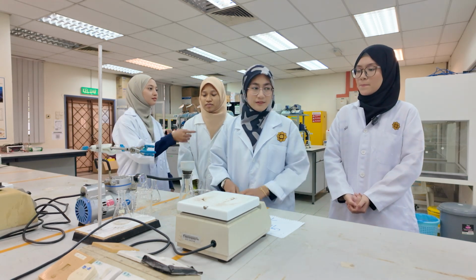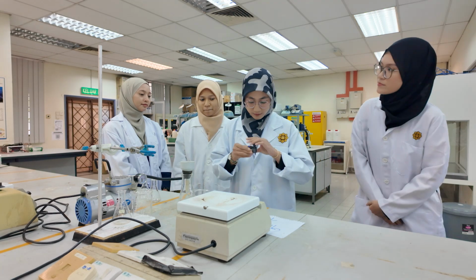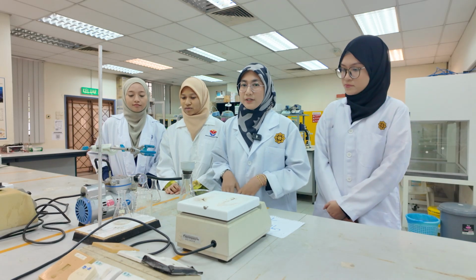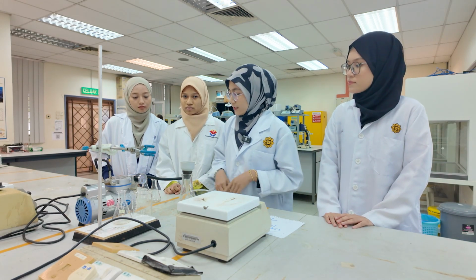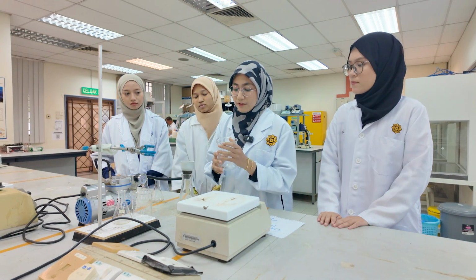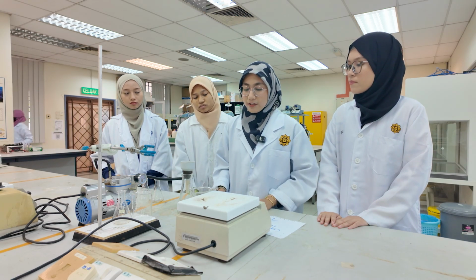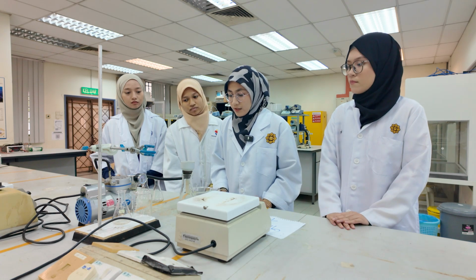Okay, now I'm going to explain about the equipment and method for recrystallization of the acid. First, the equipment that we need is 2 conical flasks, 1 beaker that contains ice, a filtration funnel, a vacuum pump, filter paper, and the last one, a heating plate. So let's move on to the method part.